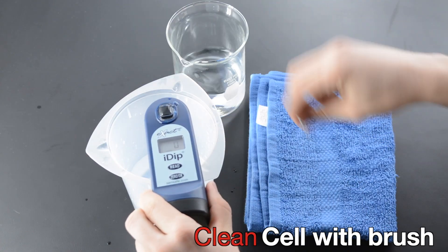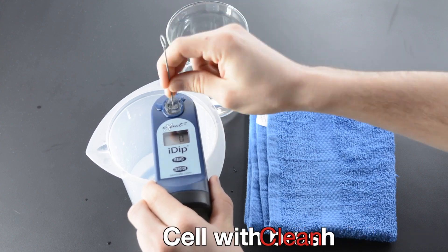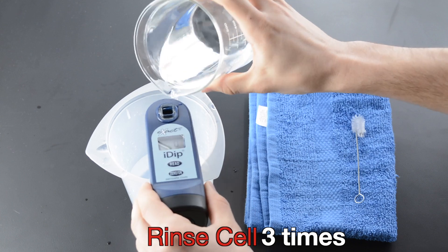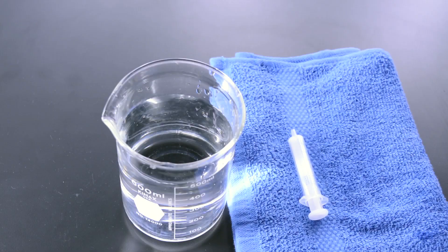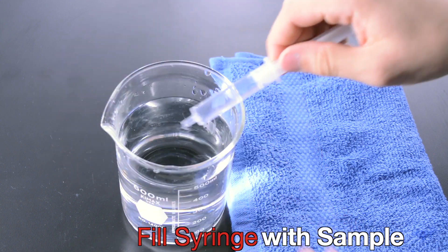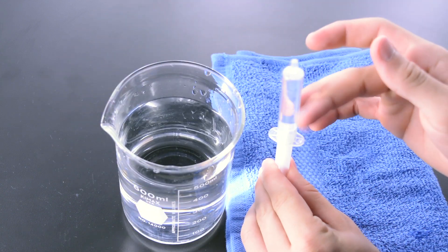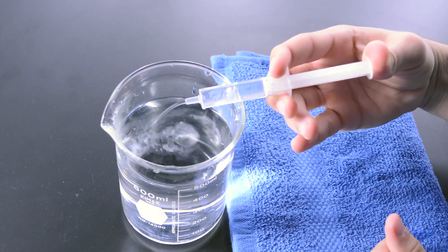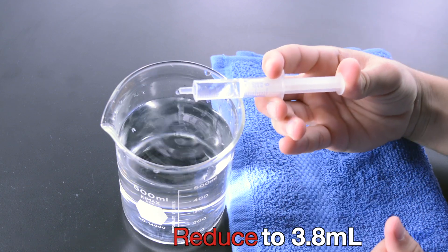Clean cell with brush. Rinse cell three times. Fill syringe with sample. Remove air bubbles. Reduce to 3.8 milliliters.